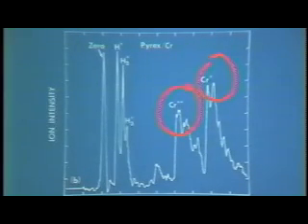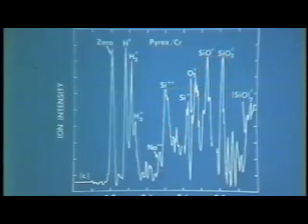Once we've popped the coating away, one sees the species that are characteristic of the glass layer itself. So you can even look at glasses, using laser pulses to thermally raise the temperature. Remember, field evaporation is a thermally activated process. Go to high temperatures, no field, get evaporation. Go to low temperatures, high fields, get evaporation. Go somewhere in between, you can use temperature to evaporate.